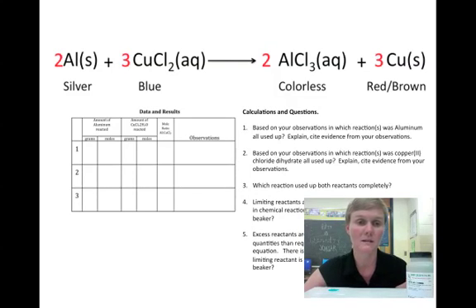If you haven't printed this out, please stop the video and print this data table out. We are going to answer 5 questions and discuss them after we get through doing this chemical reaction. So make sure you have your data table ready to go.